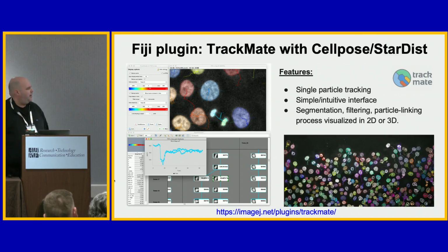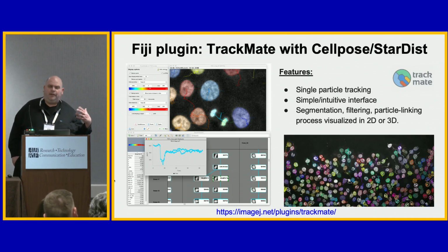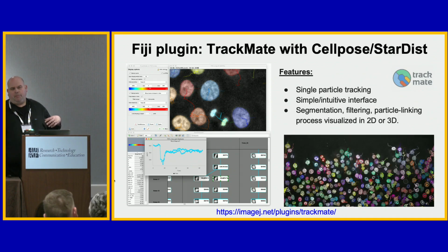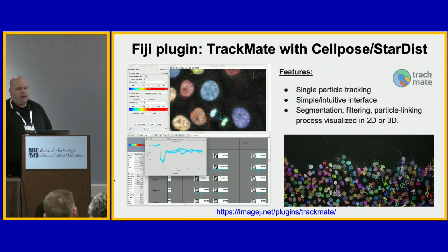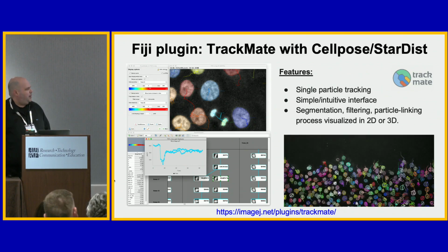other tools, including Napari. This is a fantastic way of combining the Cellpose and StarDist I just talked about with TrackMate. Again, very well documented. They're coming up with a new paper on it. Very good documentation. A lot of online videos, too, that I'll talk about, and YouTube videos. But again, a great way to get started.